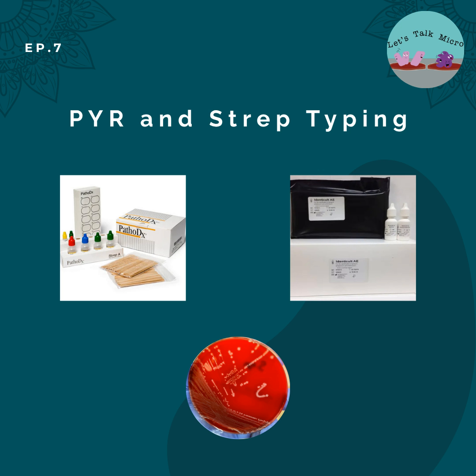Remember, if you're reporting Enterococcus versus Streptococcus agalactiae, there's a difference. That can be different treatments. Enterococcus can cause nosocomial infections, and they're resistant to vancomycin. So just be careful. When you have those beta hemolytic colonies, look at your plate. If it's a blood plate, go ahead and test it.